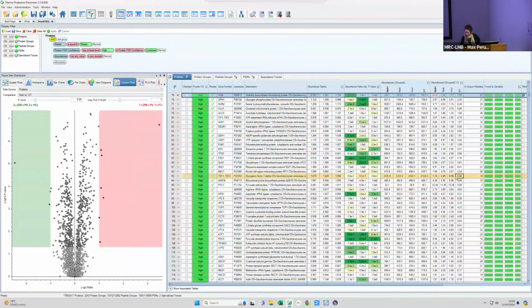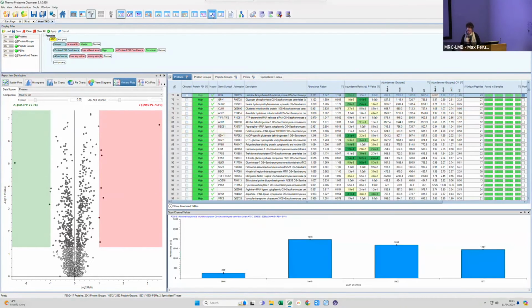This is actually because I've marked, you remember that I told you that we have the function of including a certain subset of protein sequences as markers. I've already done this to make my life slightly easier. So I've marked the proteins that have been knocked down. You can see here, this is one of the strains, so let's look at the protein abundance across the other strains and see what's happening.